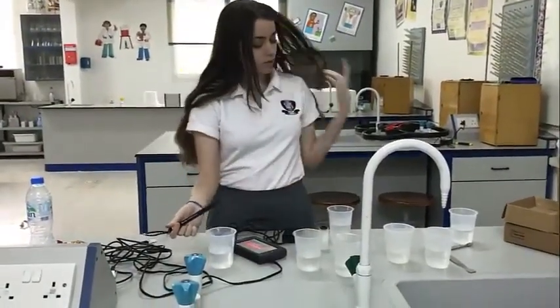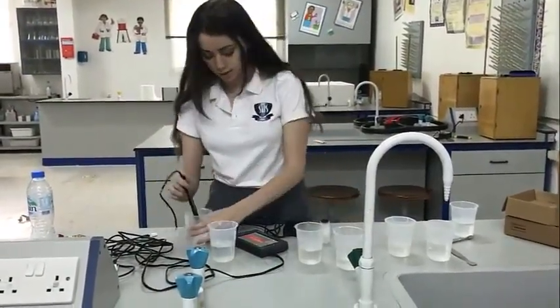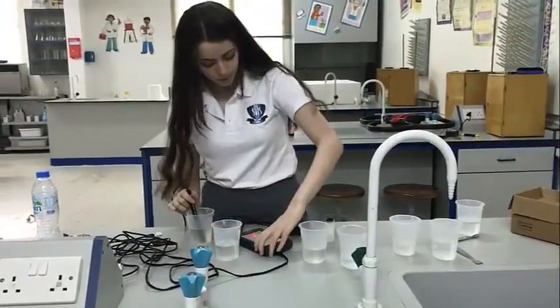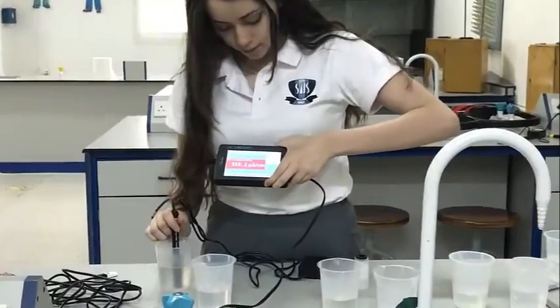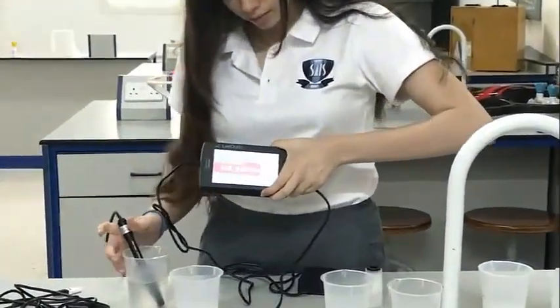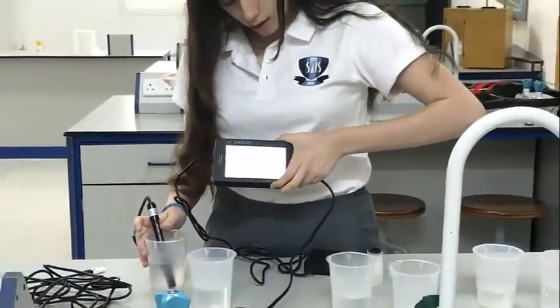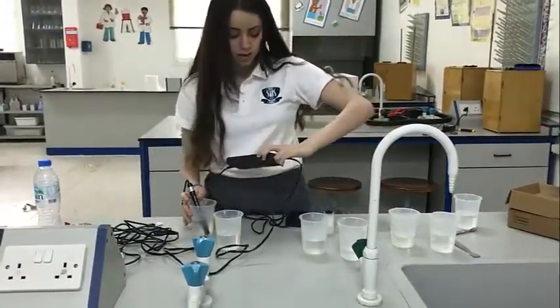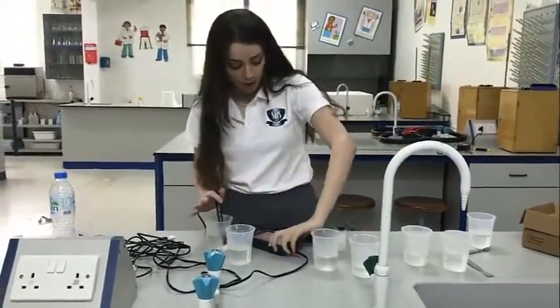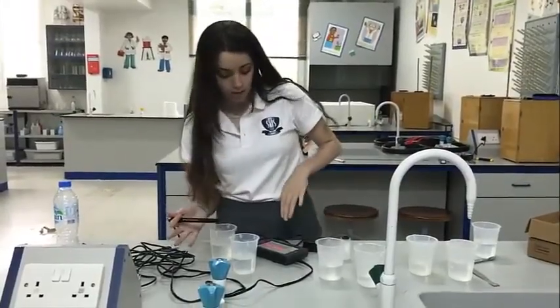And now we're going to try with added salt, and it increases. The conductivity increases. It's approximately 318.6 microsiemens per centimeter. And that was for the conductivity sensor.